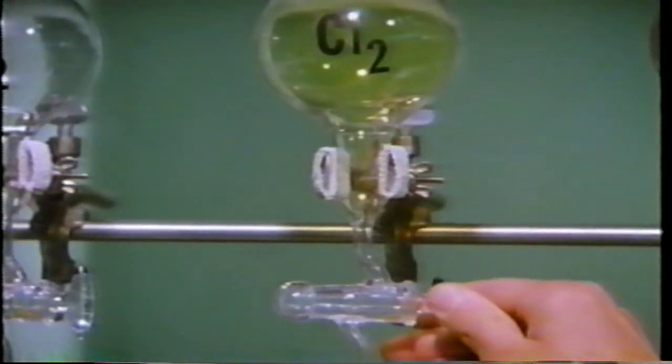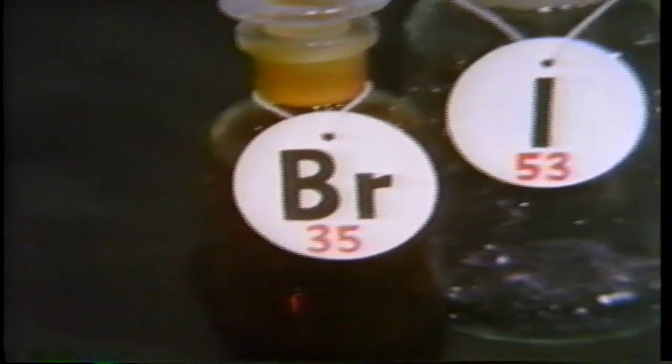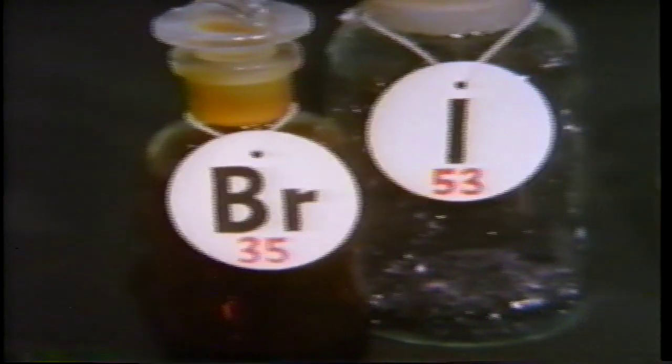When we add chlorine to phosphorus, there is a reaction. Bromine also reacts, as does iodine. The phosphorus reacted with all of this possible family except the hydrogen. You saw earlier that hydrogen, fluorine, and chlorine did react with potassium. Do bromine and iodine react with potassium?